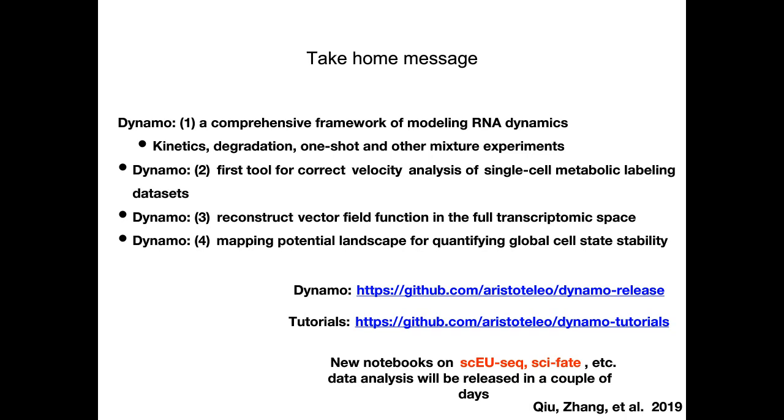Secondly, I hope I also convinced you that Dynamo is the first tool that performs correct velocity analysis that explicitly models the labeling and considers the labeling time. Thirdly, Dynamo can help us reconstruct the vector field in the full transcriptome space. And lastly, Dynamo is able to quantify the global cell state by mapping the potential landscape.